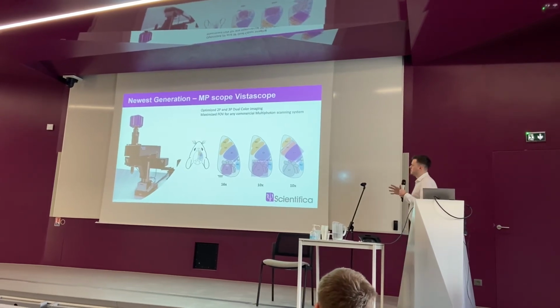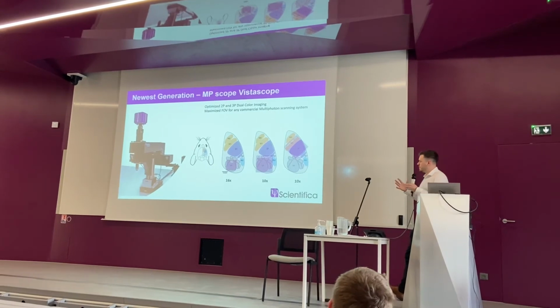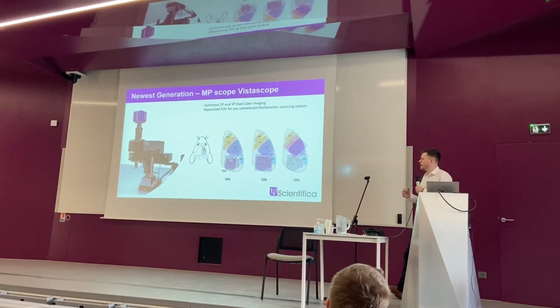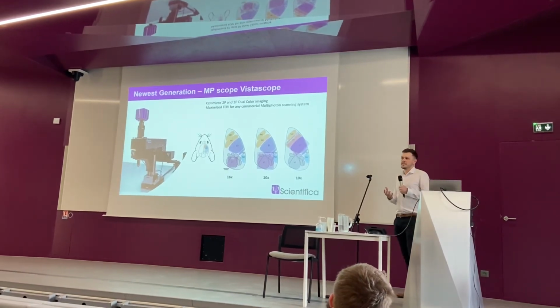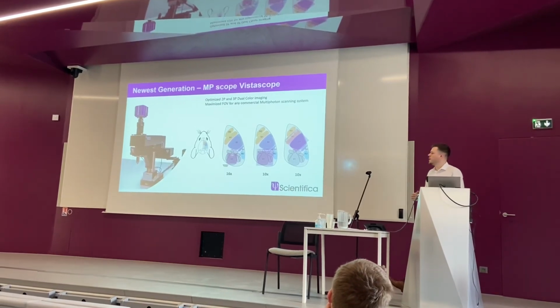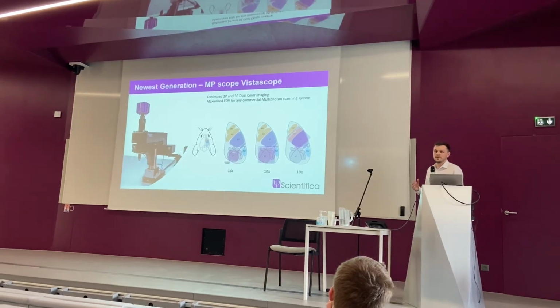I was thinking about cerebellum relevance, and because of the curvature and things, maybe getting a big use of this huge field of view may be less exciting. But what it would potentially mean is you can use some of these really nice higher magnification, higher NA objectives, like the 25 times, which would then preserve a millimetre field of view on the system.